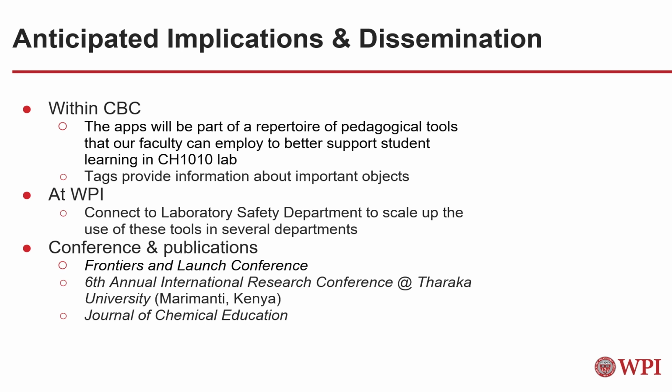We anticipate that the 360 Lab Tour and Co-Molecular AR apps will be part of a repertoire of pedagogical tools that Chem 1010 lab instructors can use to enhance learning outcomes. We also expect to use this across the chemistry and biochemistry curriculum. Finally, we are currently working with EHS to find ways of implementing these tools across WPI's campus. To disseminate our work, we plan to present our findings at national and international conferences, and we are in the midst of preparing a manuscript for the Journal of Chemical Education.